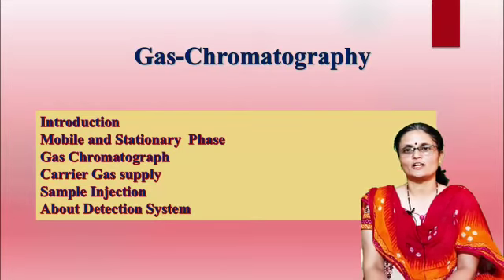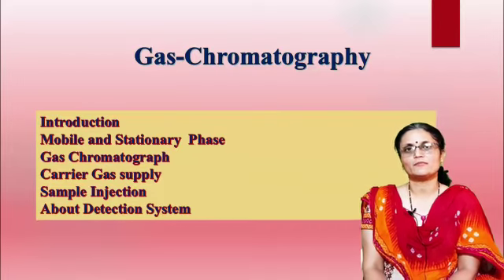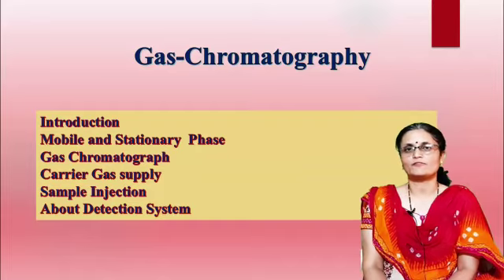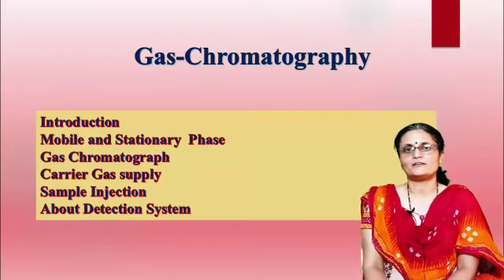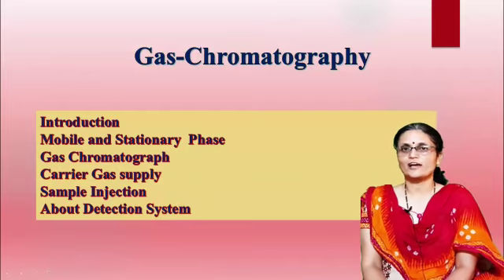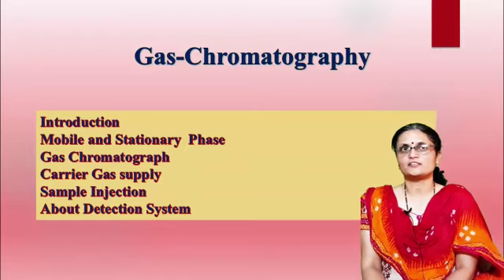Today we shall be talking about gas chromatography. Gas chromatography means what? Chromatography is a technique of separation, analysis and identification. Chroma is color, graphy is for writing. In gas chromatography, actually we do not see different colors, but separation is definitely done.